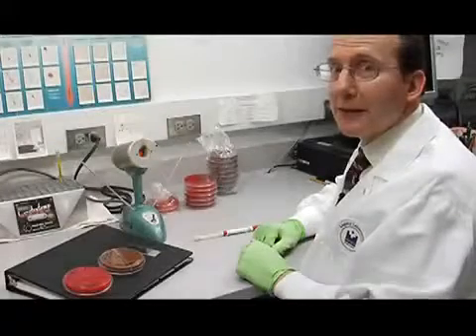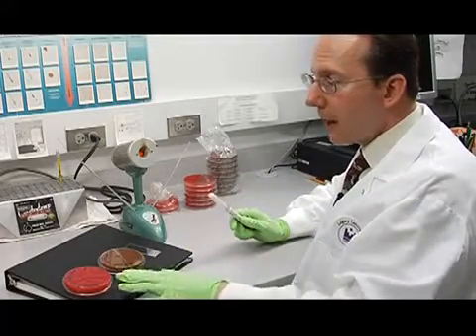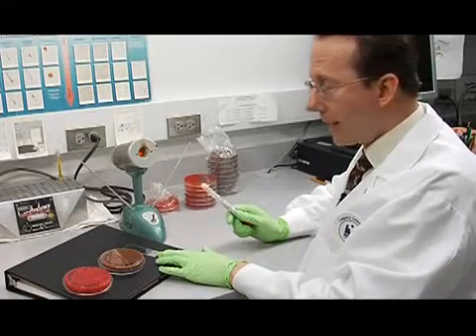Now I'll show you how to set up a female genital tract culture. This is another example of a primary or direct culture. We'll be using a swab, and we'll set it up on a blood agar plate, a Martin Lewis chocolate biplate, and we're going to make a smear on a slide.